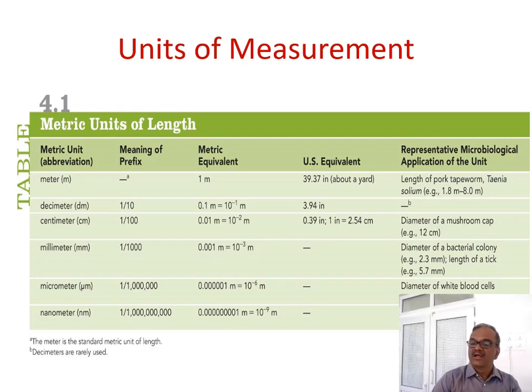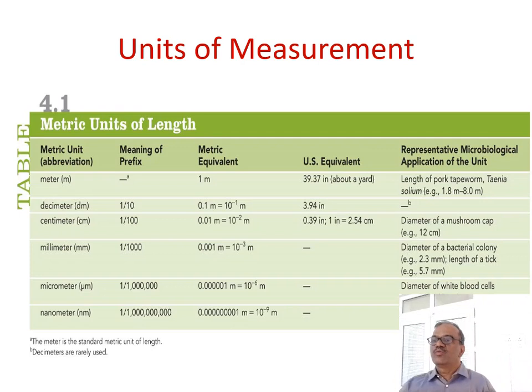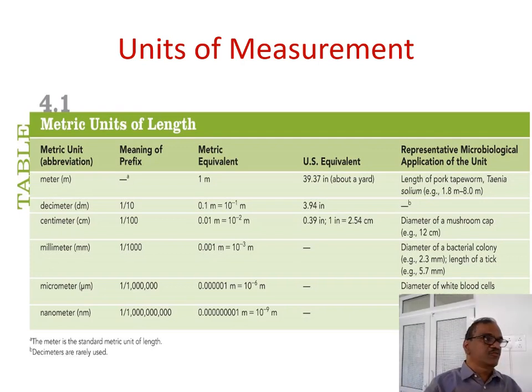Then millimeter, the diameter of a bacterial colony. You take a Petri plate, inoculate it with a particular medium, and grow bacteria in it. The bacterial colony is growing. You want to measure it, and that is in the millimeter range.